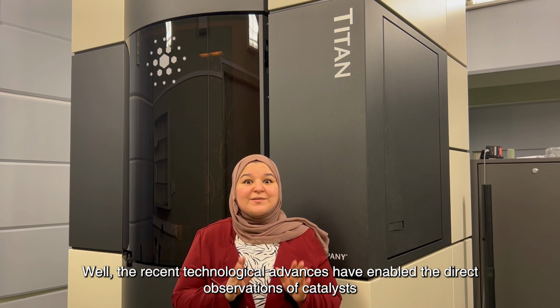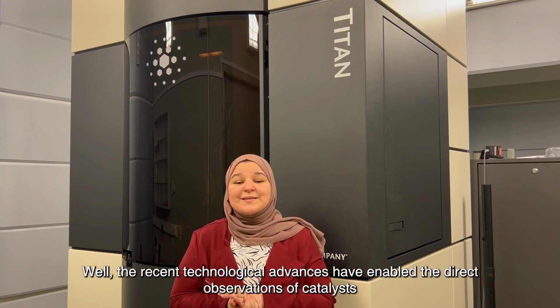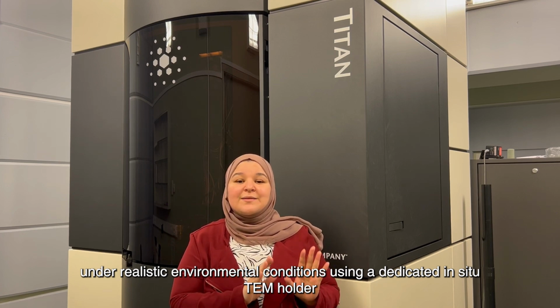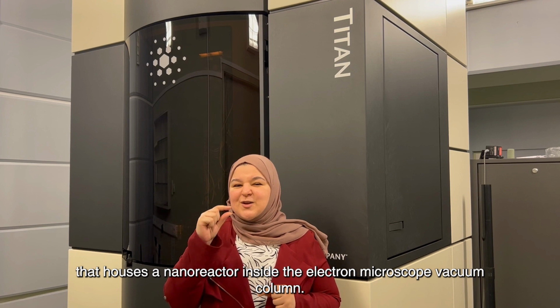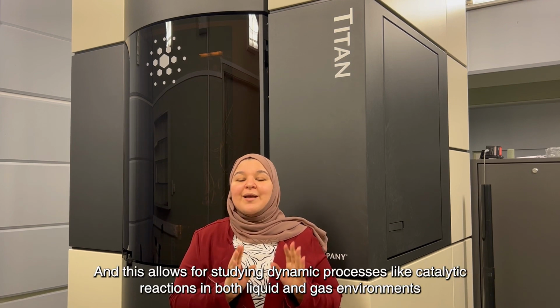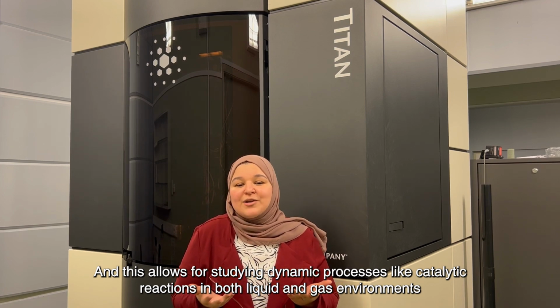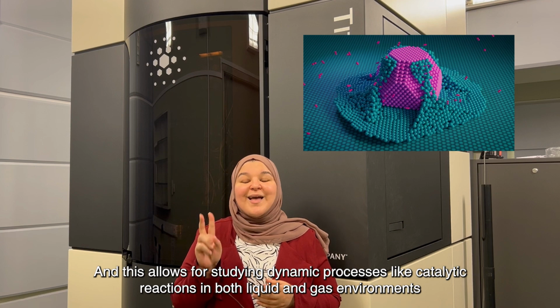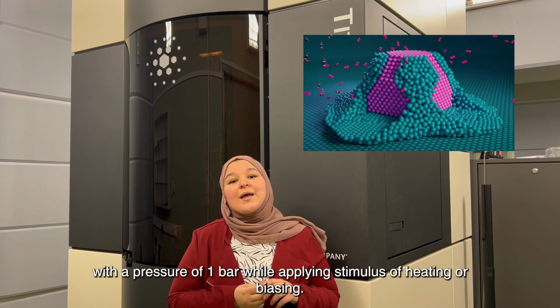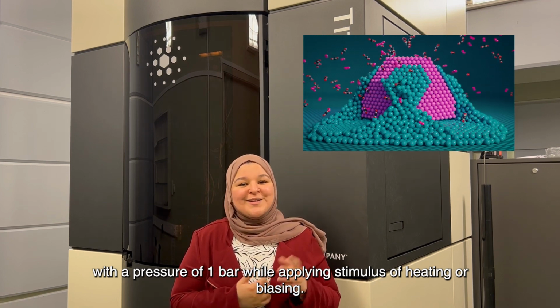Well, the recent technological advances have allowed for direct observation of a catalyst under realistic environmental conditions using dedicated in-situ TEM holders that house a nano-reactor inside the electron microscope vacuum column. And this allows for studying dynamic processes like catalytic reactions in both liquid and gas environments while applying a pressure of 1 bar and applying a stimulus of heating or biasing.